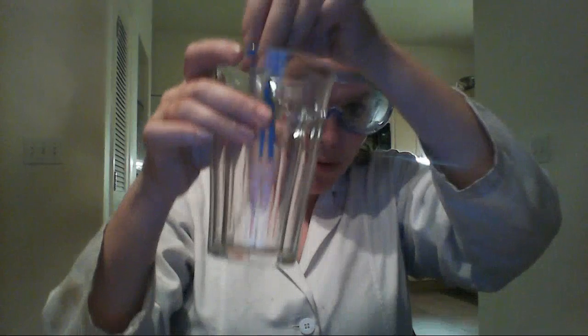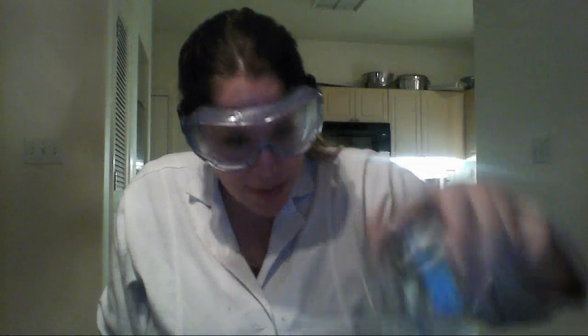I'm going to set it just in that same empty glass. I happen to have my pipette resting there. That's fine. I'm just going to put it here and let it sit for 10 minutes. Okay, just let that stuff sit 10 minutes. That will give this DNA time to precipitate out. And then we're going to come back and actually take that DNA up and stick it in our little necklace tube and make a necklace out of it, which we can wear. So I will be back in 10 minutes.